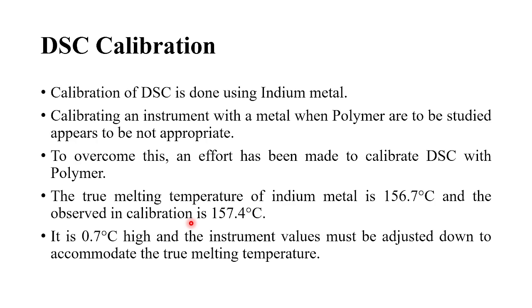To overcome this, an effort has been made to calibrate DSC with a polymer. So the true melting temperature of indium is 156.7 and the observed calibration is 157.4. So it is 0.7 degrees high and the instrument values must be adjusted down to accommodate the true melting temperature.